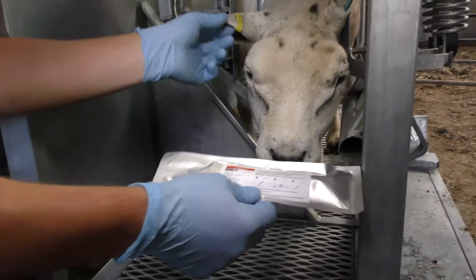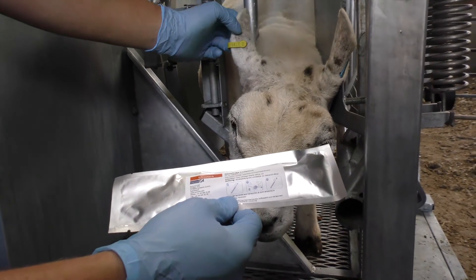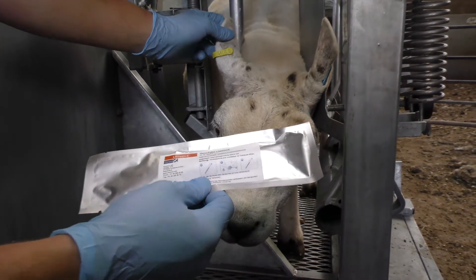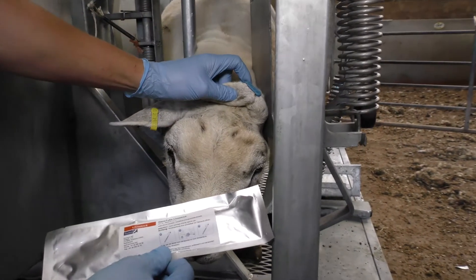So first things first, we check to see if the tag number of the sheep is on the list of animals requested to sample, and you can see there that it is.